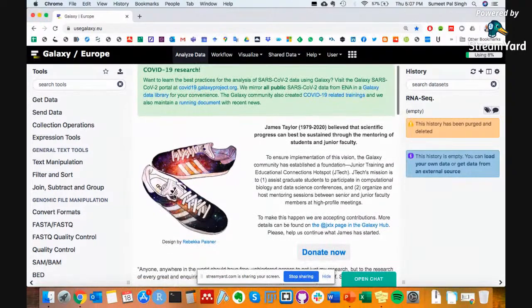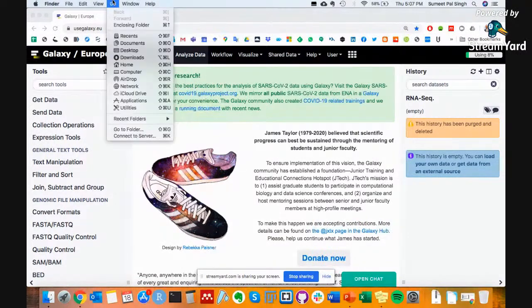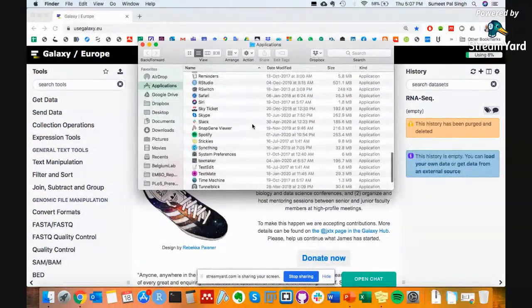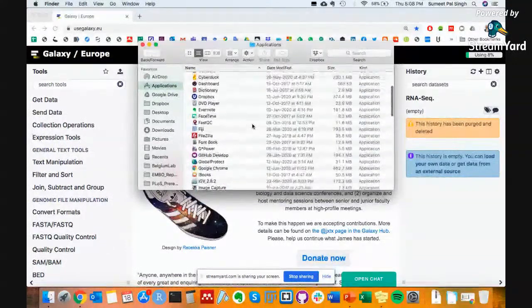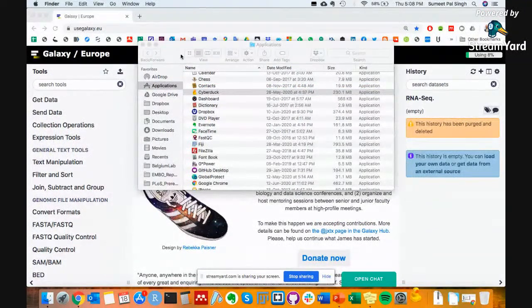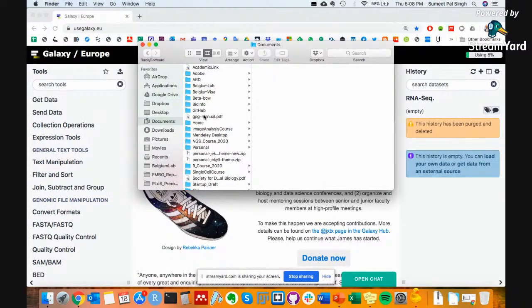And next we have to get our files, the FastQ files. For that, we can either directly upload or use the FTP server. I will be using FTP, although the files this time are not very big. On the GitHub page, the files were zipped, so you will have to unzip them, and then you will get 6 files. If you don't have them, you can pause, go to the GitHub website, and then you should have them.